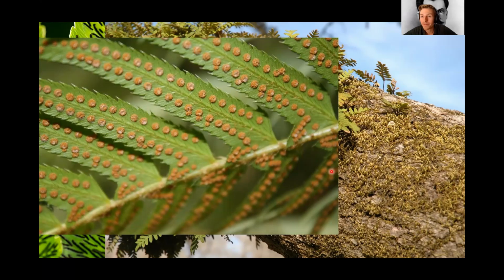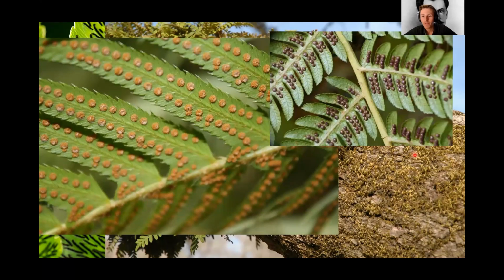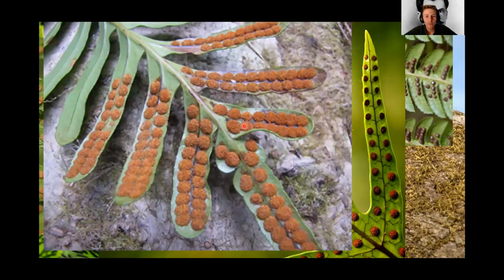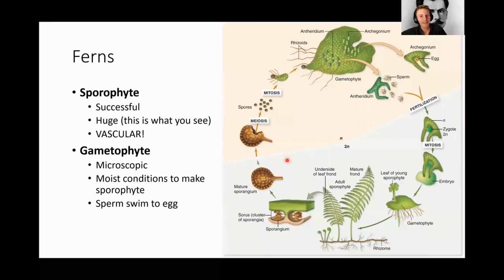It's pretty weird. Look at these, wow, look at that. Sori everywhere. Wow, these are big ones. So go look at ferns. They're really a delight. So great.